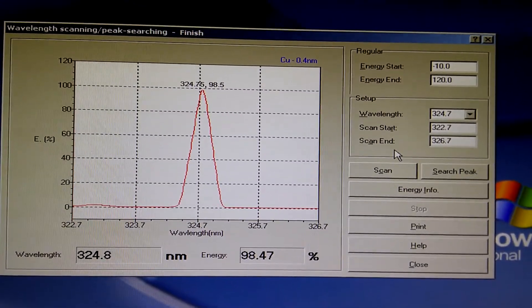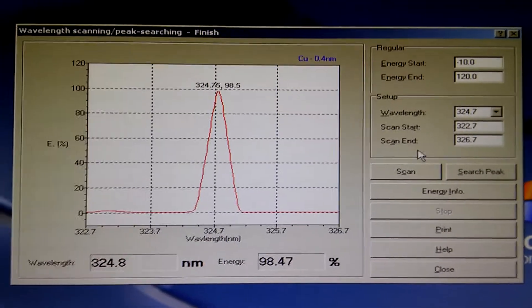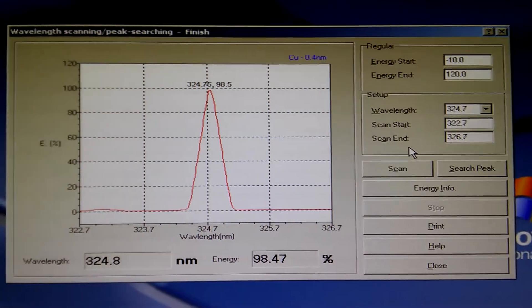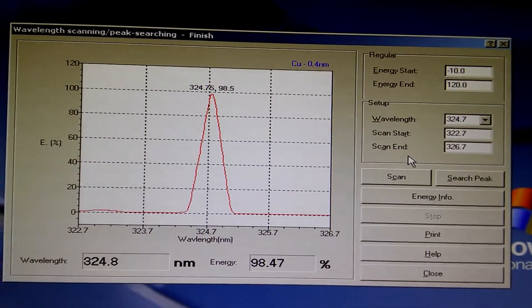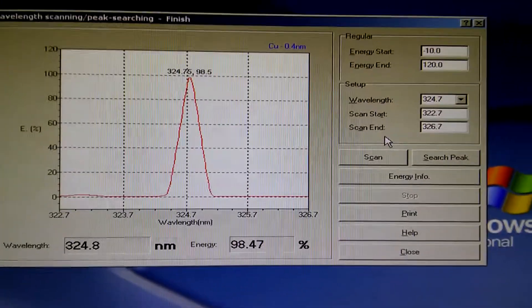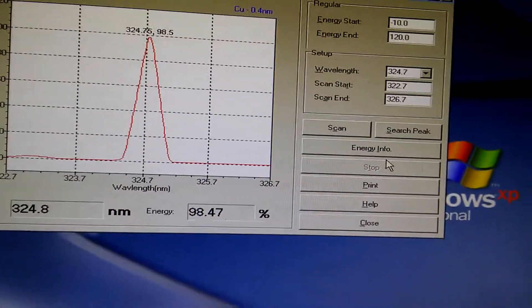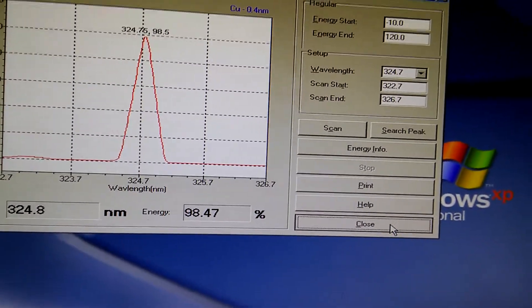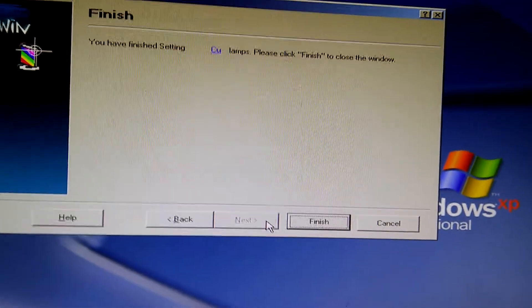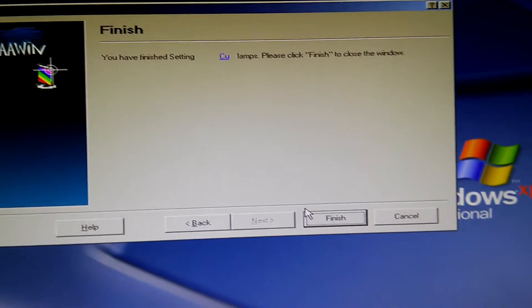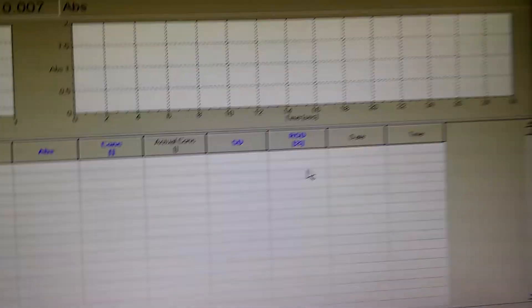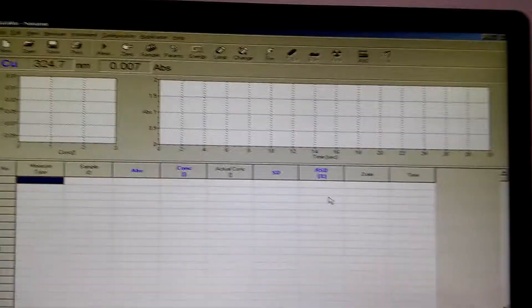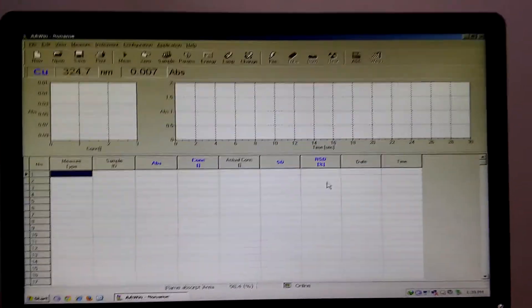The wavelength as you can see is 324.8 nanometer. Now press close, next, and finish. This is the working panel.